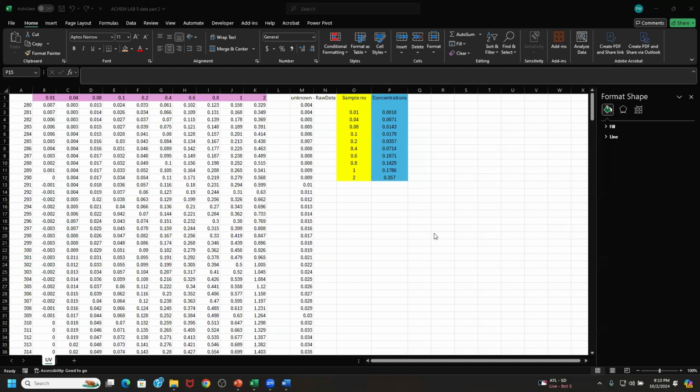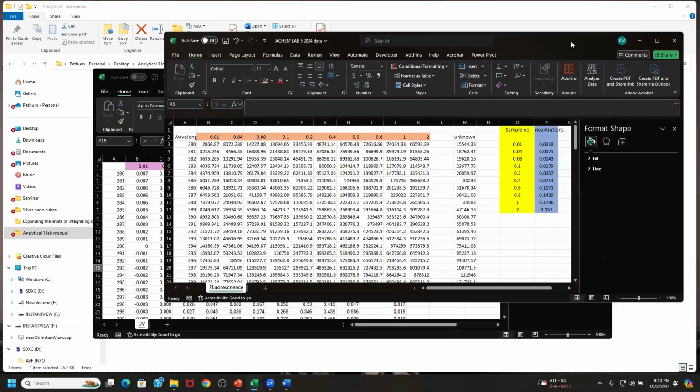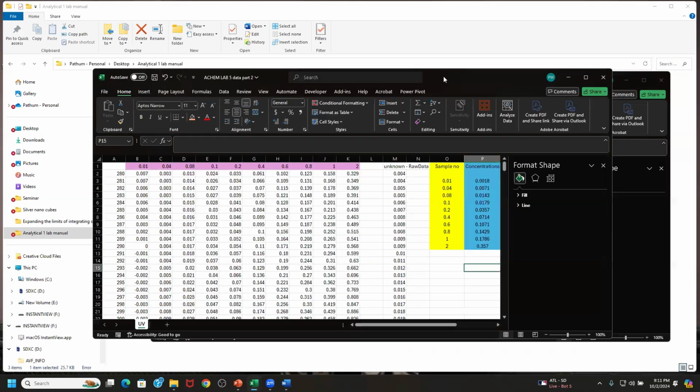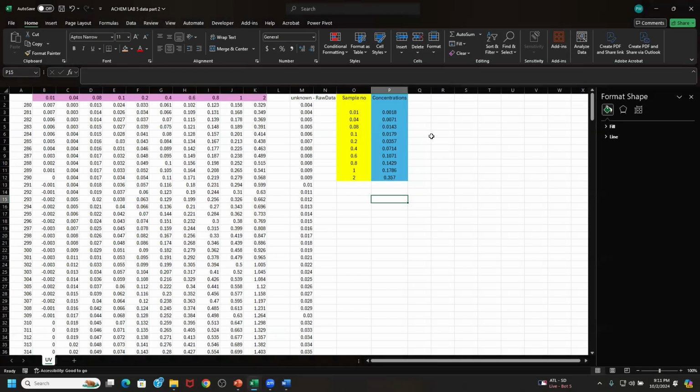Hello everyone. So this is a small video about how to analyze your UV visible and the fluorescence data for your quinine sulfate experiment. So here I have opened my UV visible data set and the fluorescence data set in the background. Okay. First, we'll go to the UV visible data set.